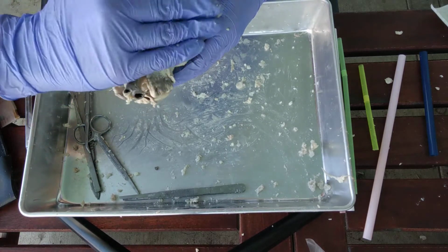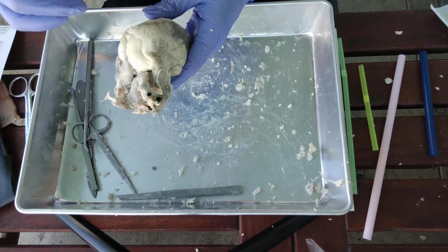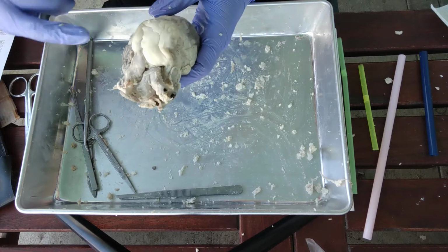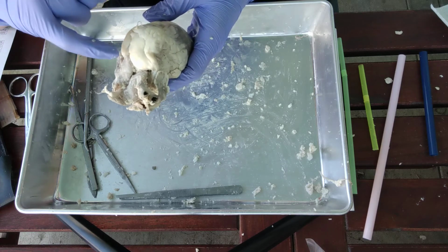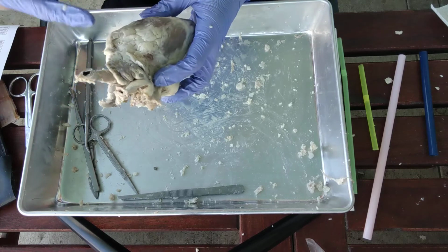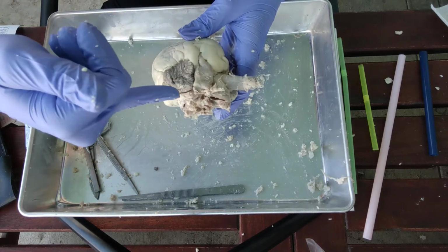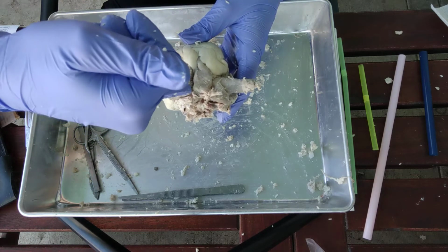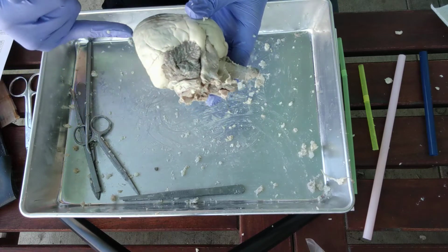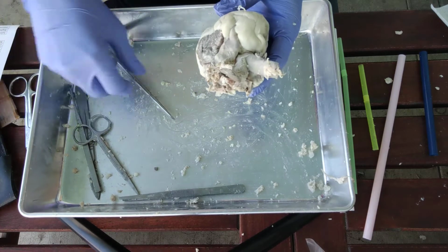We're going to end up with this little flap that will come up, and that'll allow us to look into both chambers, the right ventricle and the right atrium, as well as look at the pulmonary valve and the tricuspid between the ventricle and the atria. And then after that, we're going to go to the left side. From that side, we're going to cut from the top of the left atrium all the way down to the apex on the left side, and that'll allow us to look inside there.